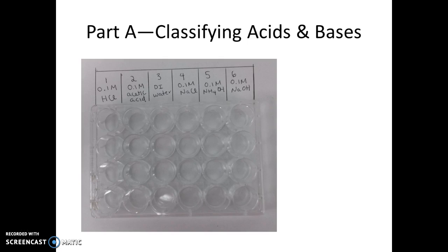To do this, obtain a 24-well plate from the front of the lab room and wash it thoroughly with soap and water, doing a final rinse with deionized water. Once you have your clean micro well plate, position it on a white piece of paper horizontally, which will give you six columns and four rows as shown here.